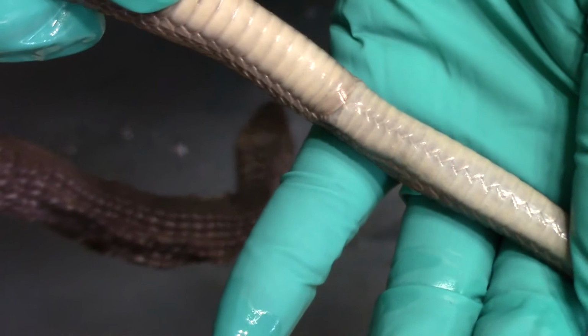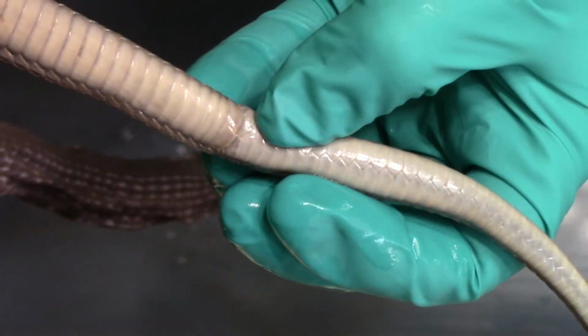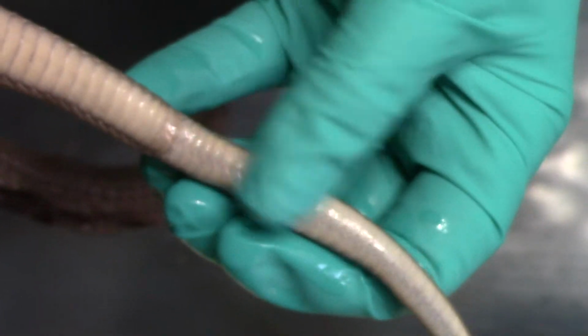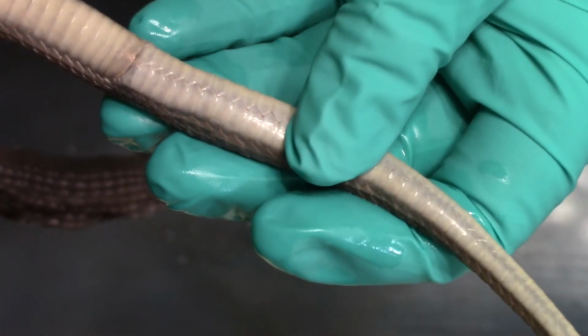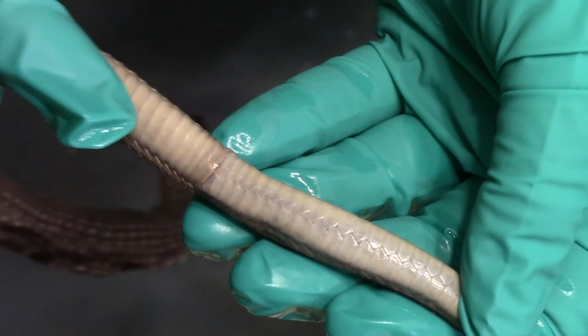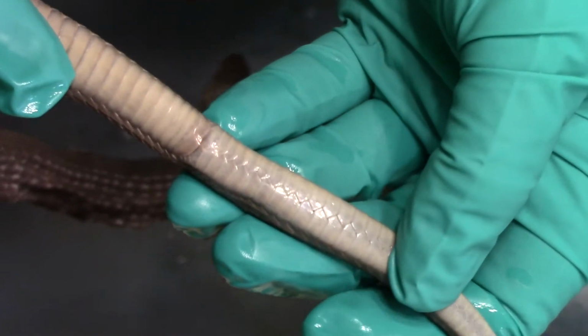On the belly of the snake, you can see that these scales anterior to the cloaca are just one overlapping belly scale. And then you can see that cloacal opening. And then in the tail, you have two overlapping scales. It's a very different change from the body of the snake, cloaca, tail of the snake.